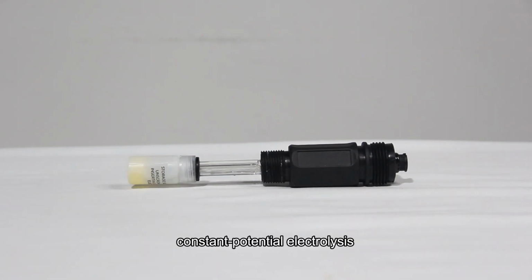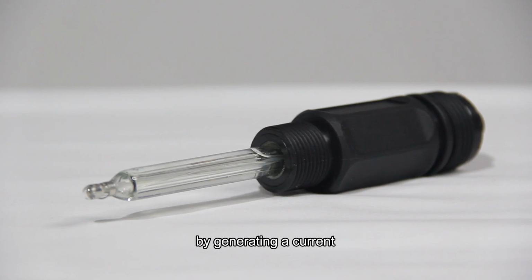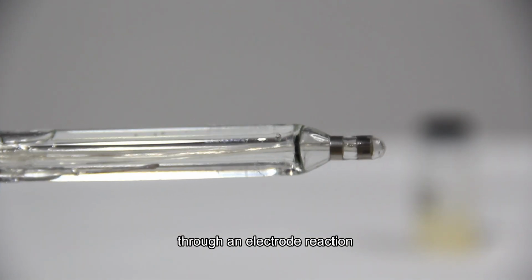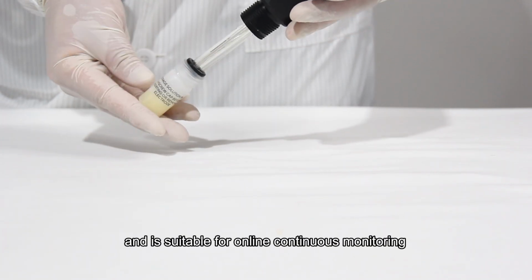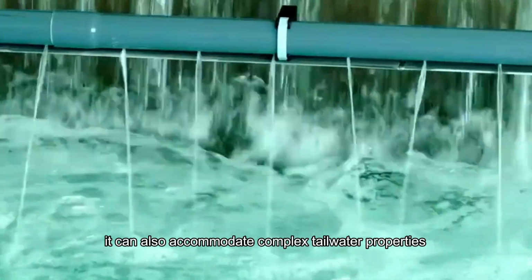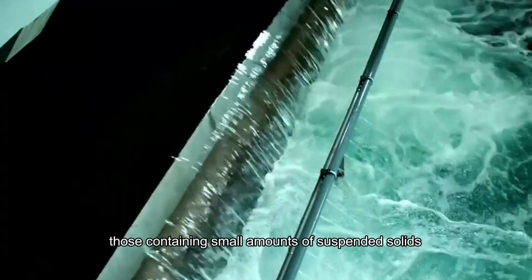Constant potential electrolysis. This method measures residual chlorine concentration by generating a current proportional to the residual chlorine concentration through an electrode reaction. It offers fast response times, requires no frequent reagent changes, and is suitable for online continuous monitoring. It can also accommodate complex tailwater properties, such as those containing small amounts of suspended solids.